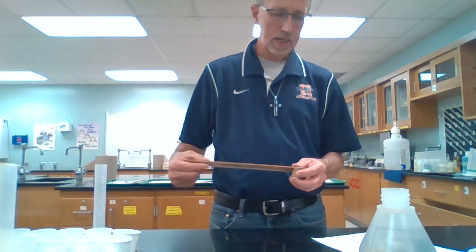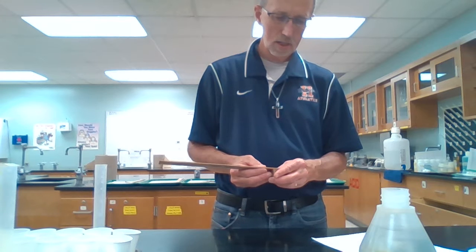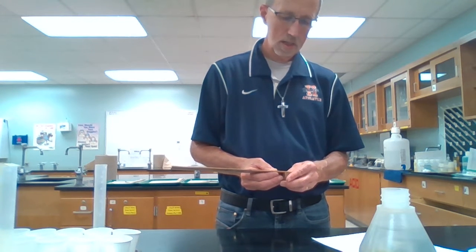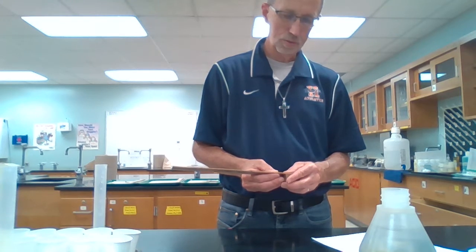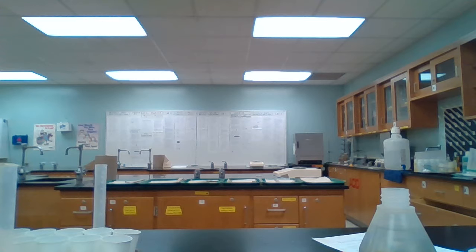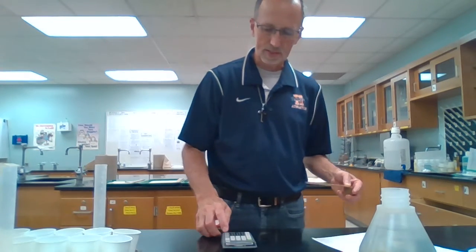And it looks like about 2. I'm going to grab my calculator. I'm going to have to calculate volume. Length, width, and height. Of course, it's a cube, so length, width, and height are all the same.